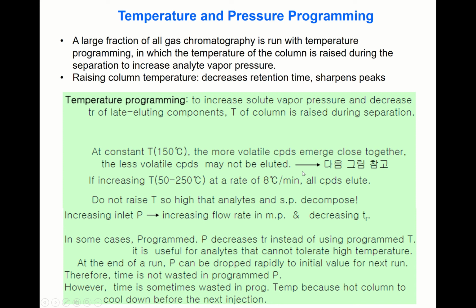So in a modern chromatographic instrument, to make the temperature decrease rapidly, the oven is opened. So the old heat may come out of the instrument rapidly.